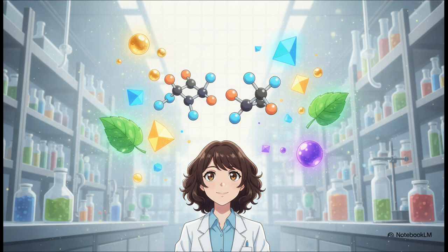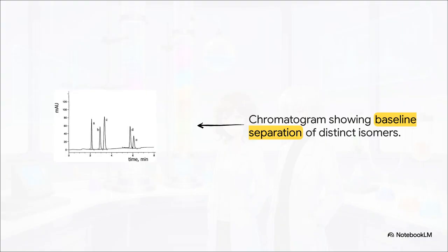Listen, if you have a molecule where just one single functional group is pointing to the left instead of the right, normal phase is sensitive enough to the spatial configuration to catch that tiny difference, lighting up our analytical displays with jaw-dropping precision. The ultimate proof of this is when you get those beautifully glowing chromatogram peaks.